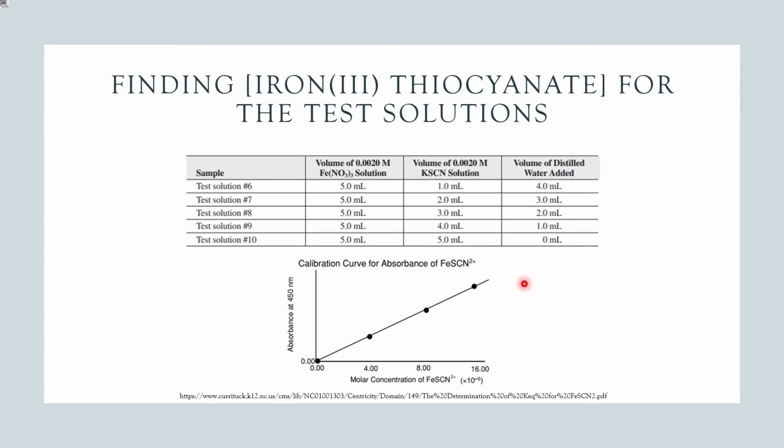So we're hoping to produce something similar to this, a calibration curve, and again, using those test solutions, being able to find an absorbance and figure out what the concentration is from that.